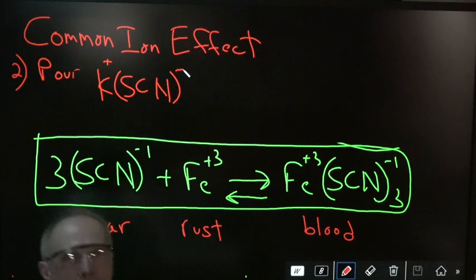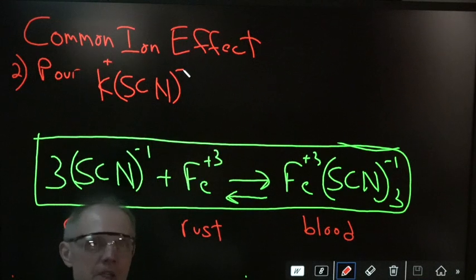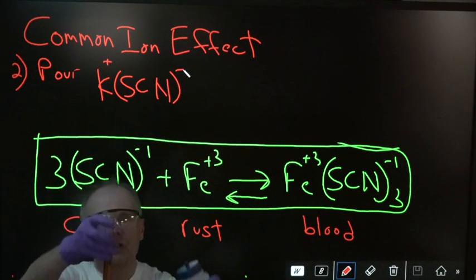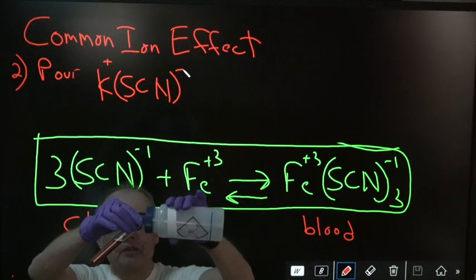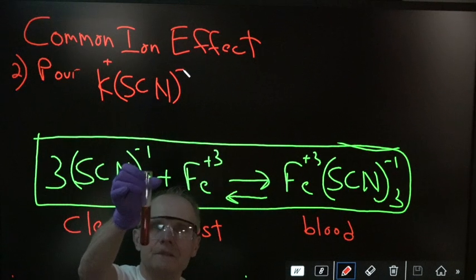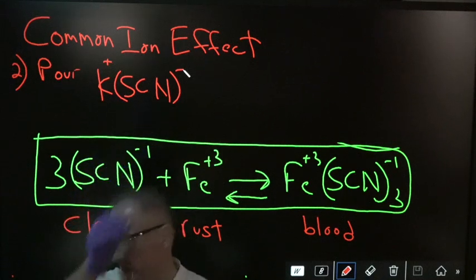So now you have to figure out which one is the common ion, where is the mound going to be, or the hole, which way it's going to fire, and what color would it probably change. All right, there's the KSCN. Here's the KSCN. Here is the Iron III Thiocyanate. Notice going down. Yep, it got darker. Not as dark as the first one, but it did get darker.